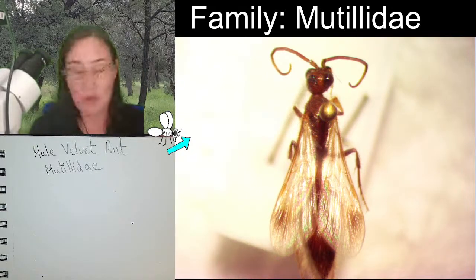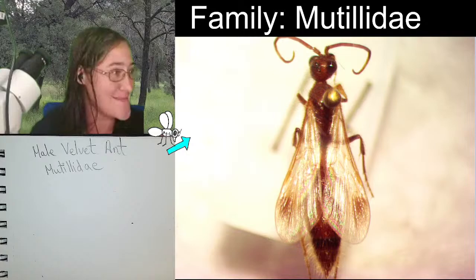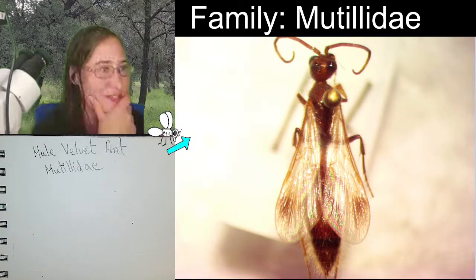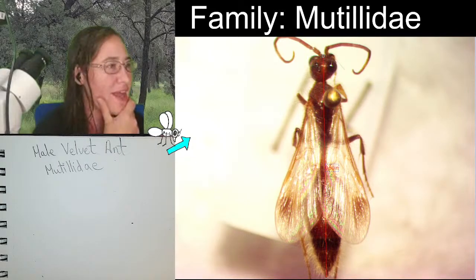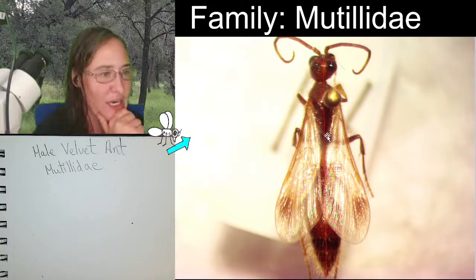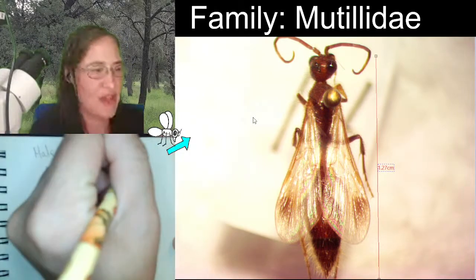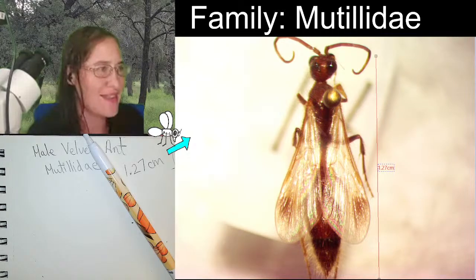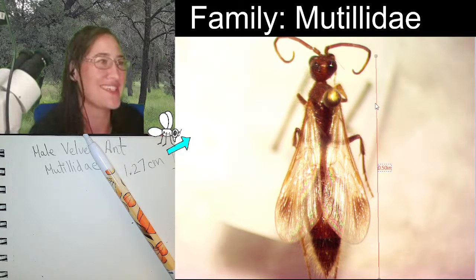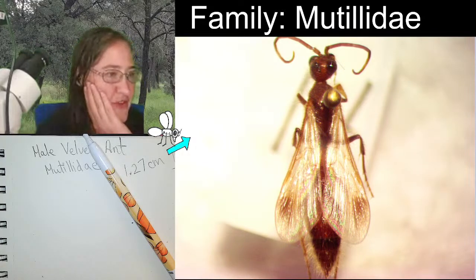Alright, but if I scooch the specimen very carefully up just an itty bitty bit, maybe, yes, we can see the front of the head and the back of the abdomen, so I do have the ability to measure it from the front to the back. And I have my measurements in inches right now, so I will go ahead and switch it back over to centimeters for us. Look at that. So, this specimen from the front of the head to the back of the abdomen is 1.27 centimeters long. And funny enough, before I moved that, it is exactly 0.50 inches. Exactly a half of an inch. That's kind of cool. That makes me happy. 1.27 centimeters is our measurement from the head to the back of the abdomen.